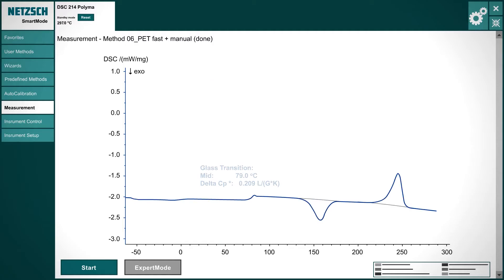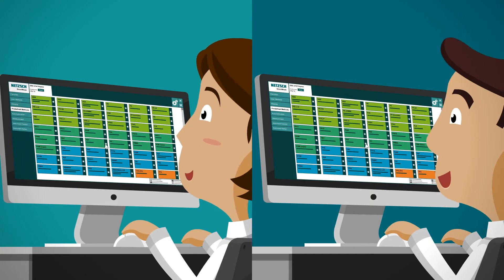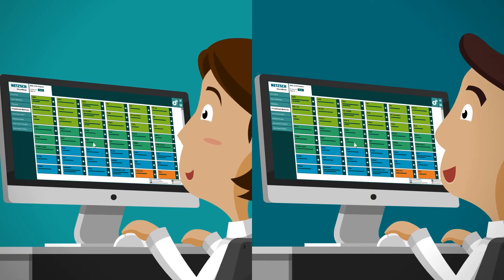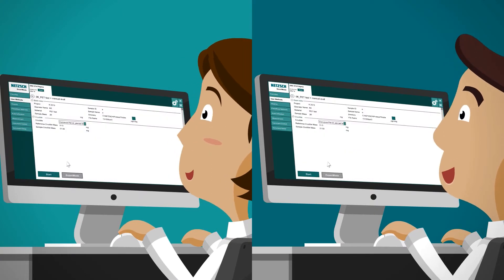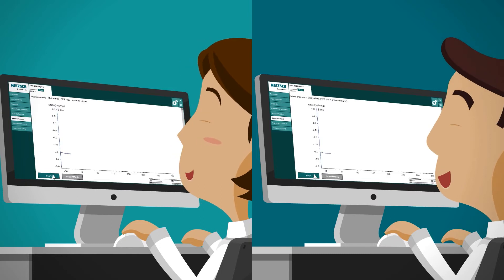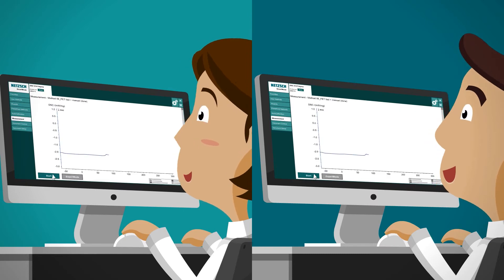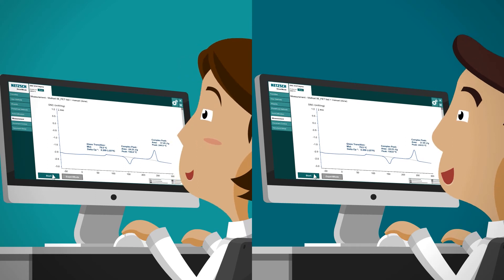Pre-defined measurement methods allow every team member to work with the same settings. Auto-evaluation provides automatic evaluation conform to standards, yielding one-click results that are free from the influence of any individual user.